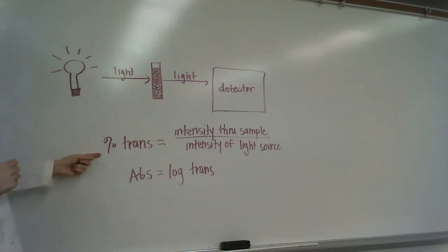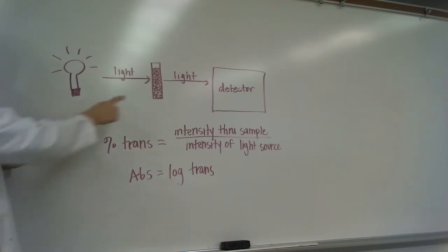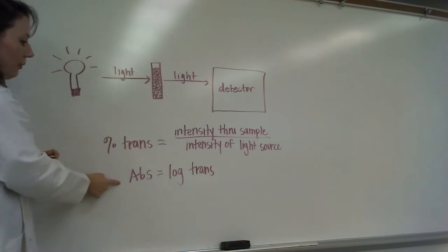We're actually not going to use transmittance today. We're going to use absorbance. So absorbance is just the log of that. Okay. So what we're doing today is we're going to put our sample in. We're going to be measuring in absorbance.